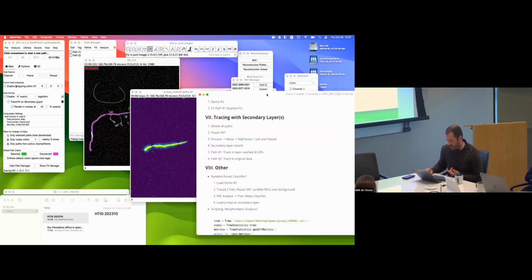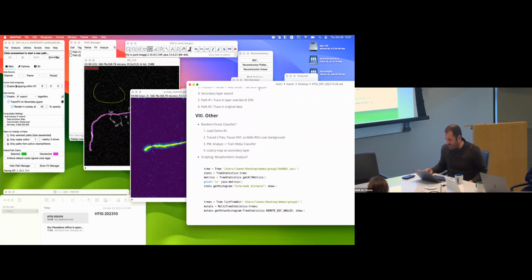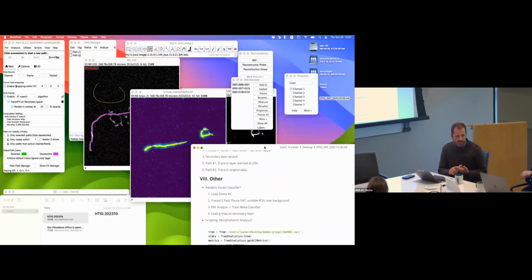And I think I don't have anything else. There are all sorts of stuff, I just don't know. Again, I think these were the most common things that people ask me. If you guys want to see SNT do morphometry stuff, we can do it, but I just don't know if you want that.